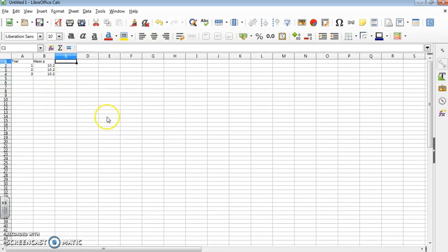The next thing I'm going to keep track of is the uncertainty on that. And I would type D mass P absolute. So what that means, I'm going to use my abbreviations. D means uncertainty, and the mass of the pycnometer, and that's the absolute uncertainty. And I'm going to type those in, and that's going to be 0.01 for each of those.